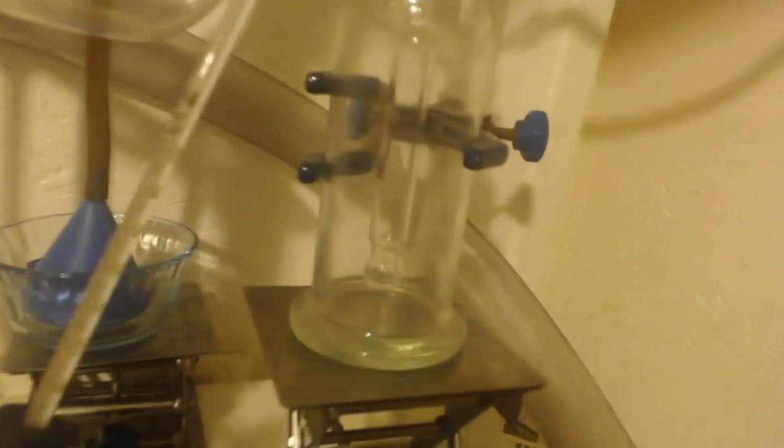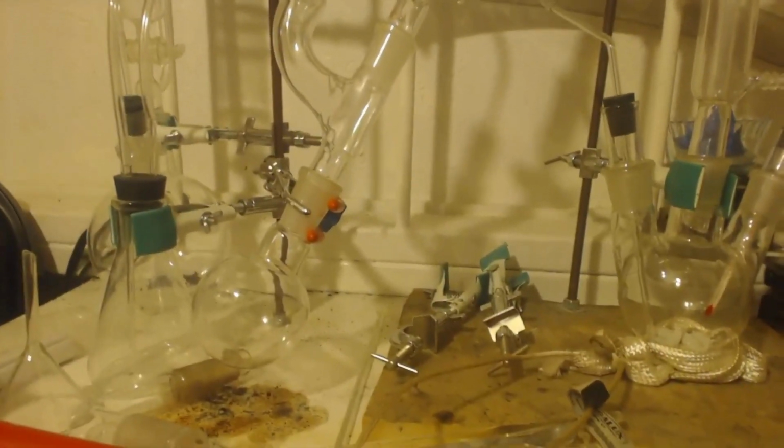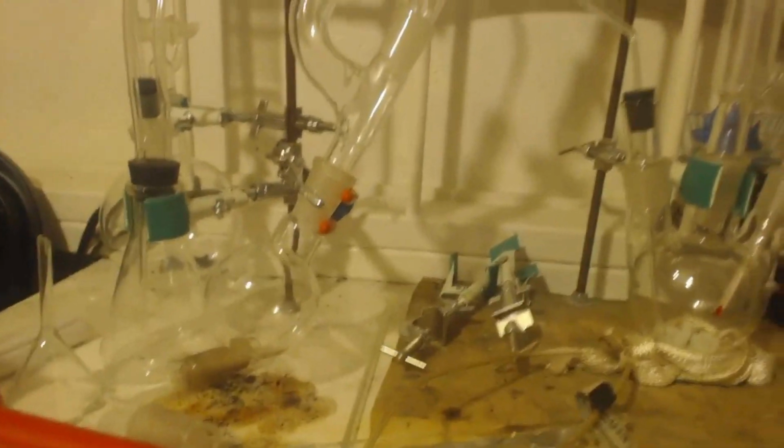And that hose, I don't know if you can see in the back there, I'll have sodium hydroxide. It's just a little pot with a funnel on it and one last scrubber. So I'll have that scrubber, I'll have this scrubber, a suck back trap, and that's basically the whole setup there, okay? So what I'll do is I'll turn this on, start heating it so that it refluxes the DCM.